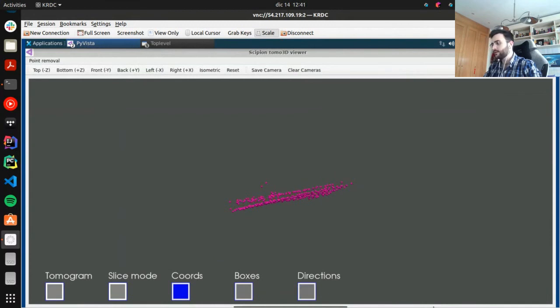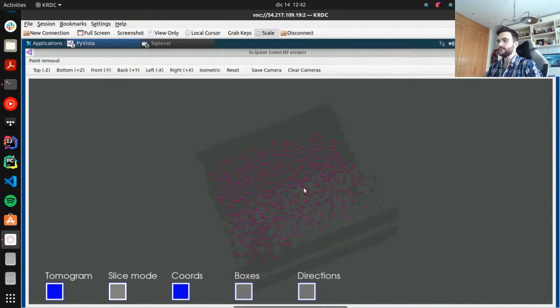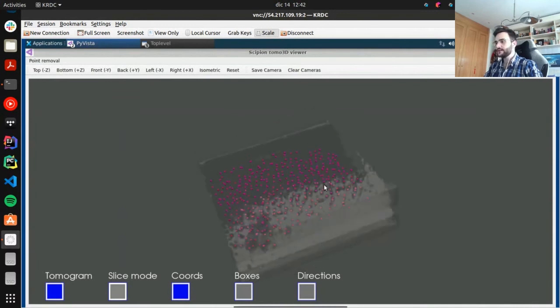Yeah, it depends. Probably you need it, but if it is still on the first iteration, it's probably going to take some time, okay? And then also we can toggle here the tomogram in 3D. So when we do this, here you will see a window, which means Scipion is loading the tomogram and is doing some operations. So in the meantime, you can still play with the viewer, okay? And when you do this, it lags a lot, as you can see, and you cannot view the contrast very well. If you have a look at the screenshots in the tutorial, or if you open it on your local PC, you will see much better contrast.